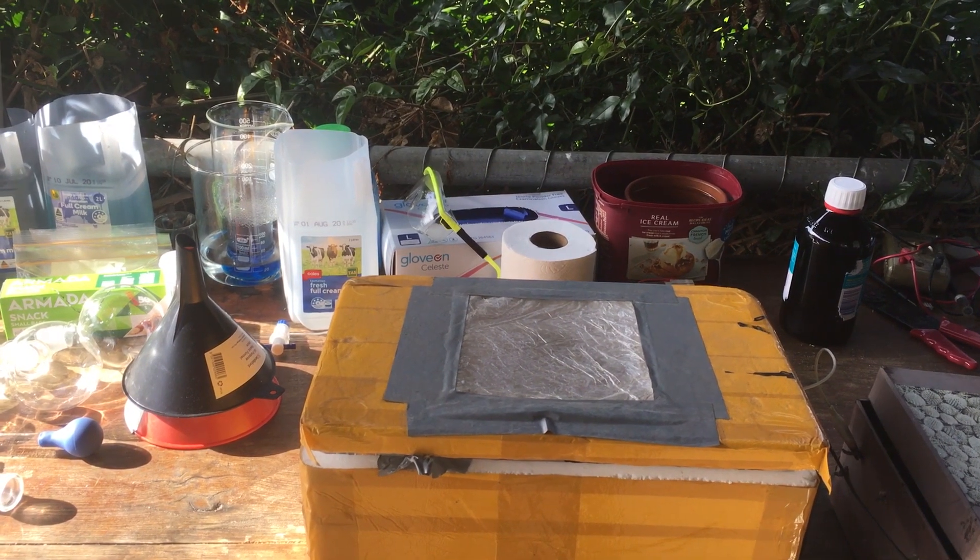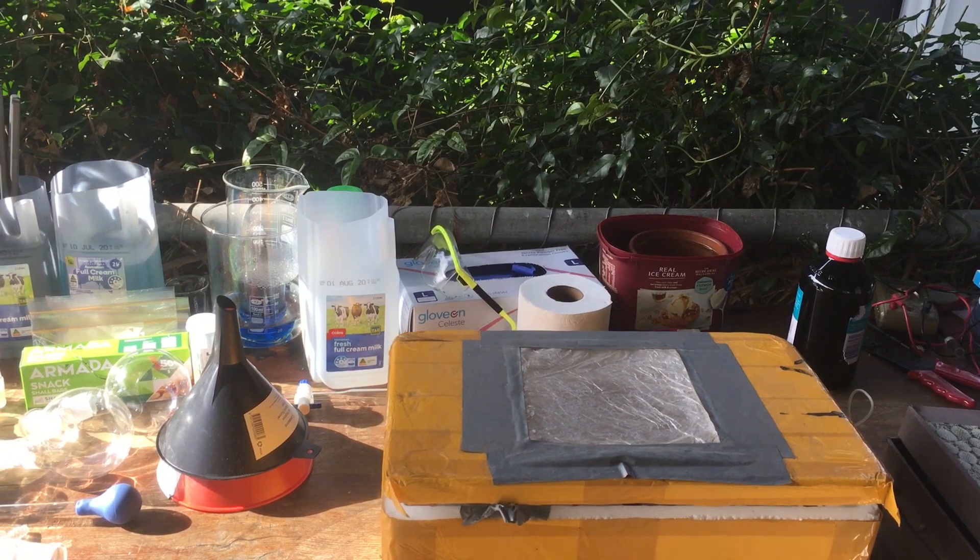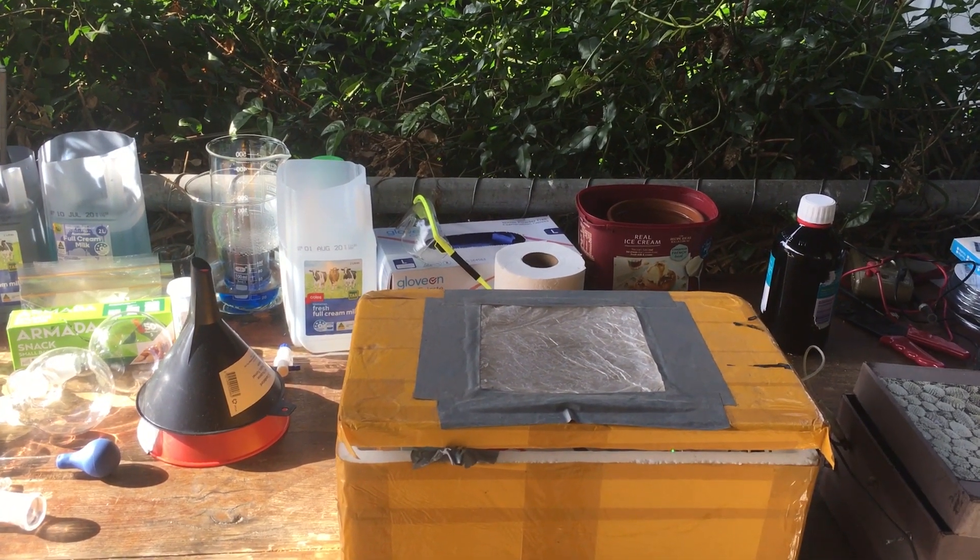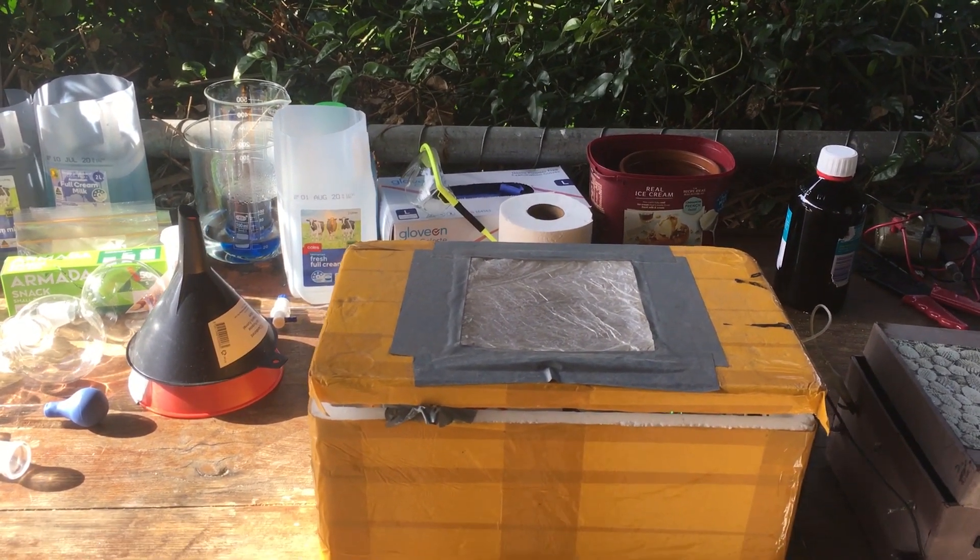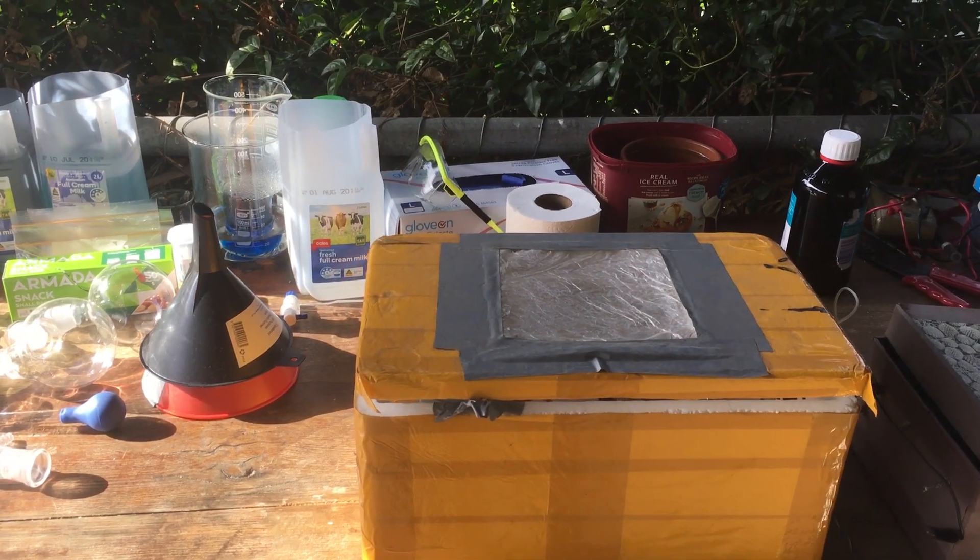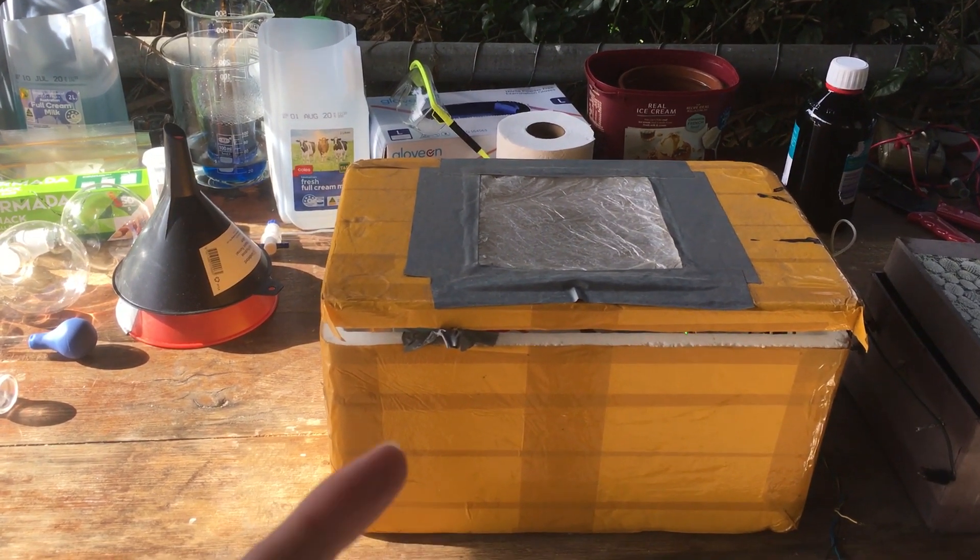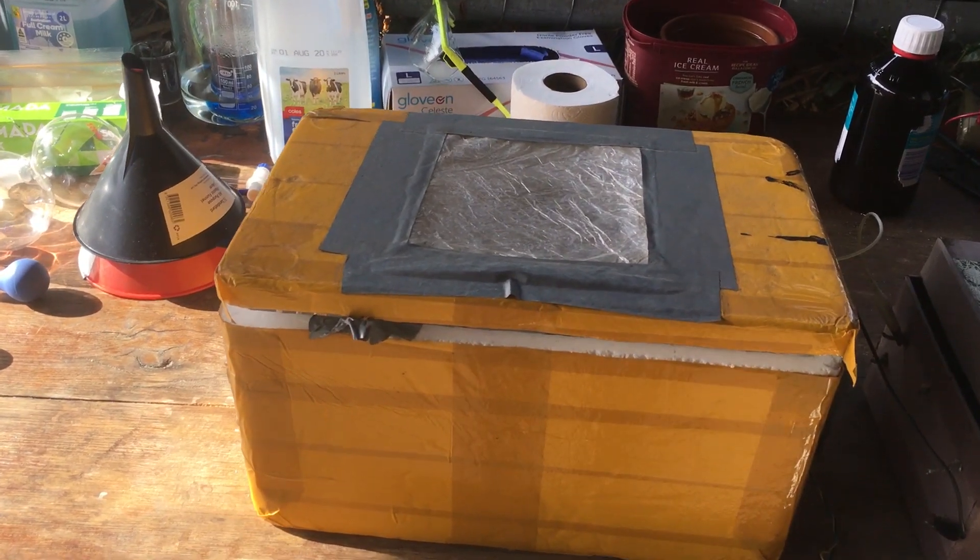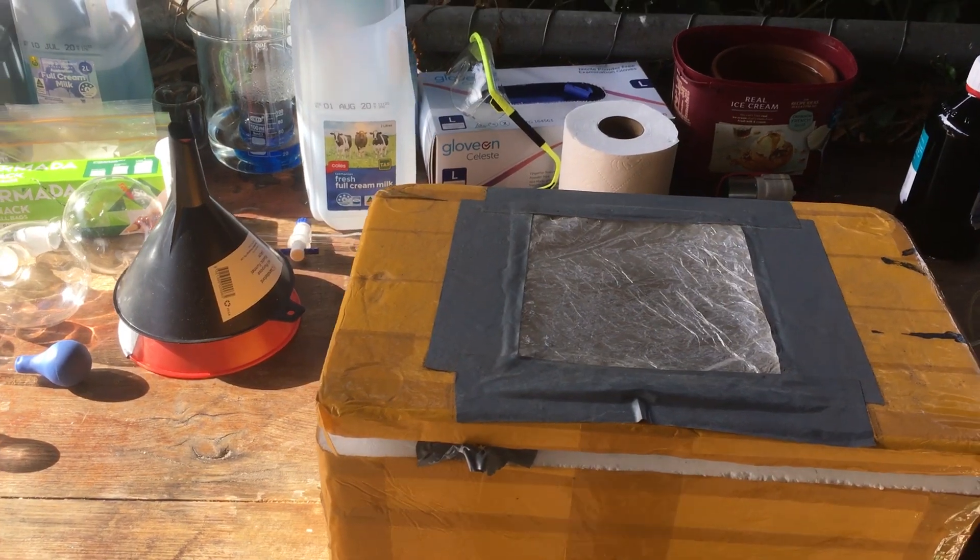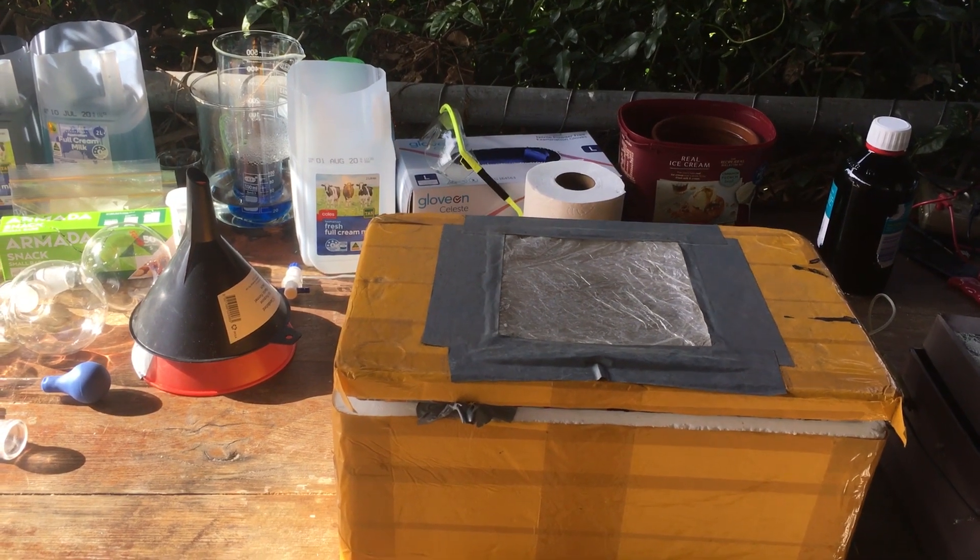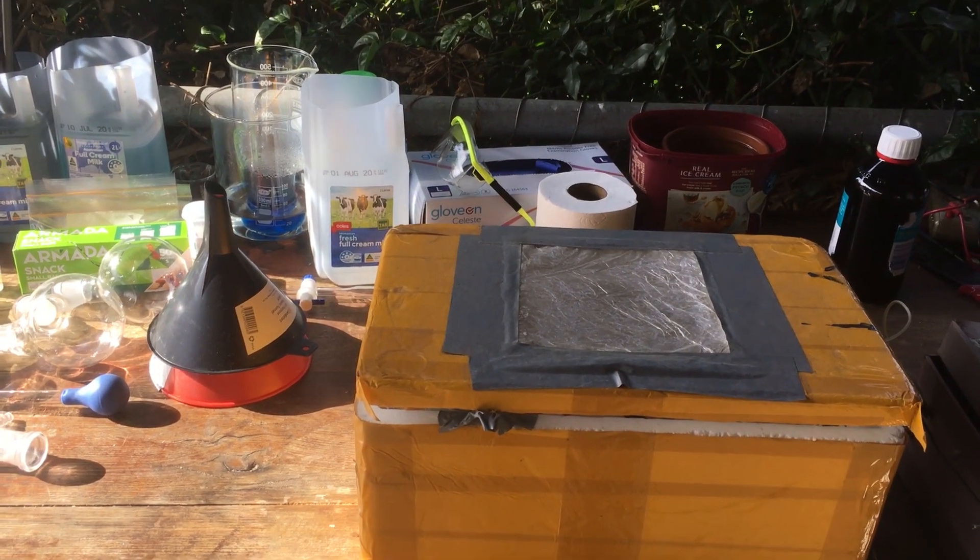So what I want to build today in this short video is a device which will hopefully be quite useful to us in future electrochemistry videos. And what I want to build is some way of measuring the charge that we put through an electrolytic cell. Specifically, I think it's called a coulometer or a voltameter. I'm not really sure.